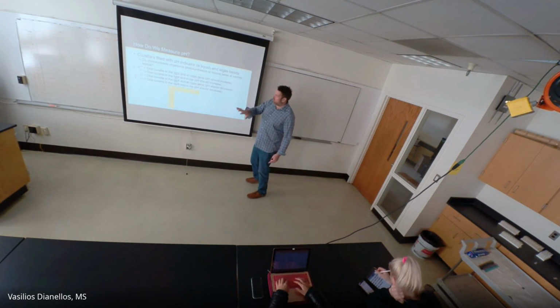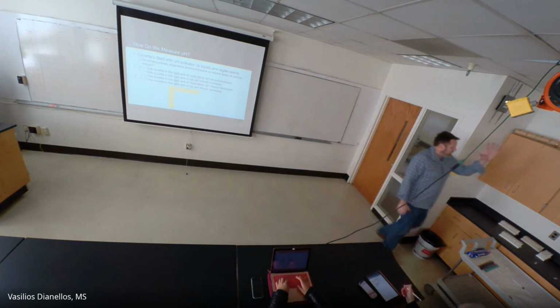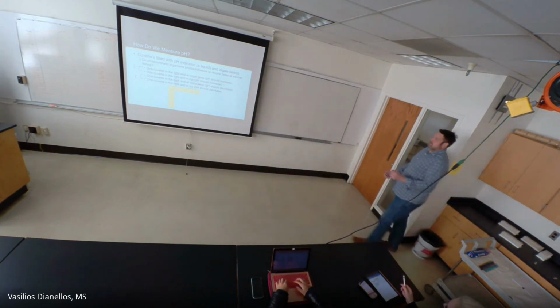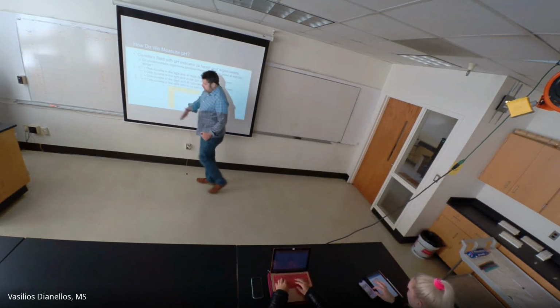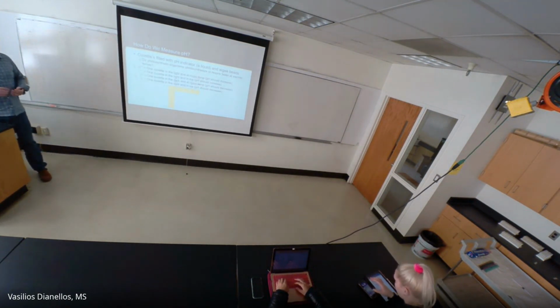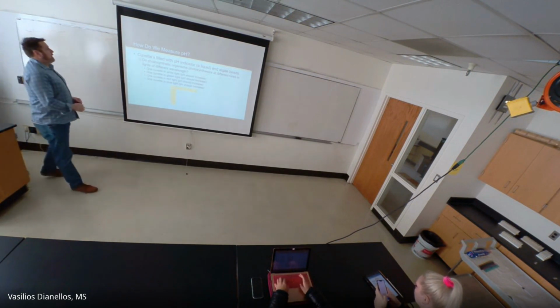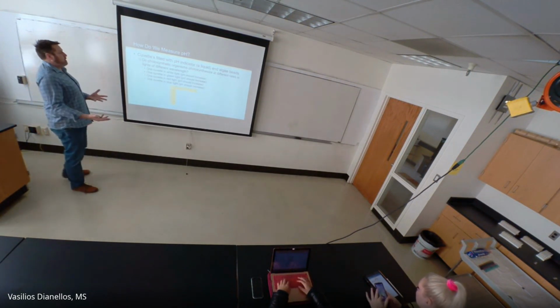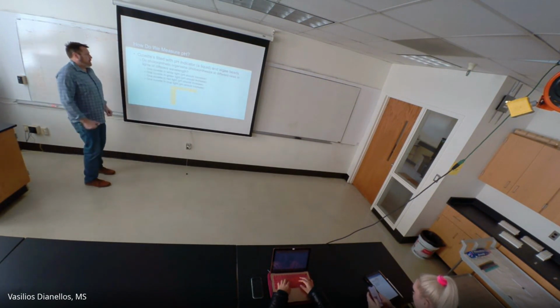Does that make sense? Your reasoning for any of your hypotheses should have nothing to do with the other experiments. We have specific experiments that deal with light intensity, specific experiments that deal with light versus dark, this specific experiment that deals with temperature, and the last one, as we're about to talk about, deals with different light color. So don't mix your hypotheses. Does that make sense? Okay. Anyway, the last one. Again, we're looking at wavelength. Does different color of light affect the rate of photosynthesis? For all 4 of these, we're expecting it to increase.